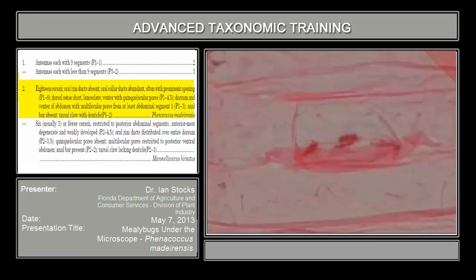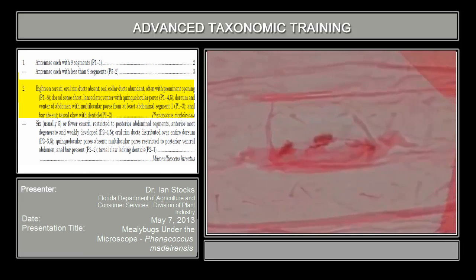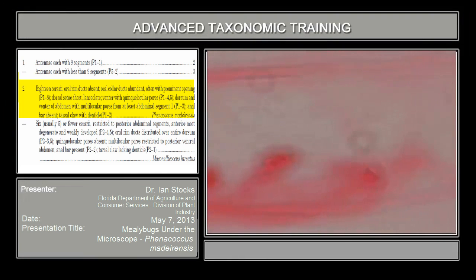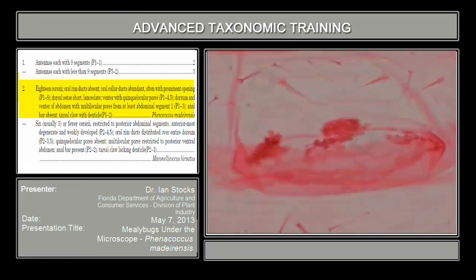Circulus is common in the majority of species, although it is something that can be absent, and in some species it can actually be multiple, so there can be 2, 3 or so circuli. Those are not that common and very distinctive when you see it. Now, if you've got that in focus at about 10x, go to 20x or so, and I want you to be able to compare this. I guess it's not an illustrated one because it's not always easy to capture as an illustration.